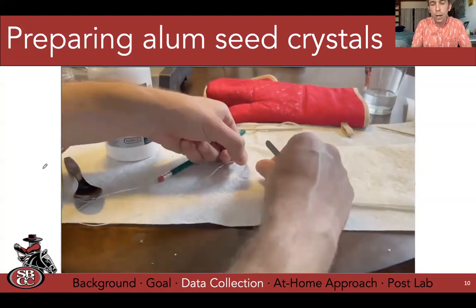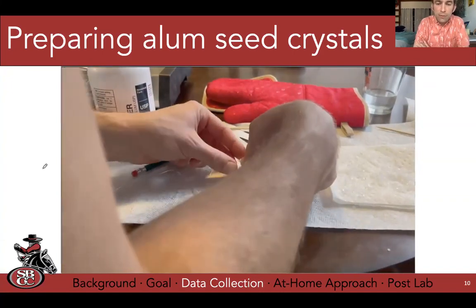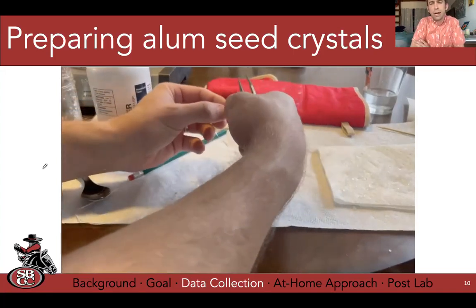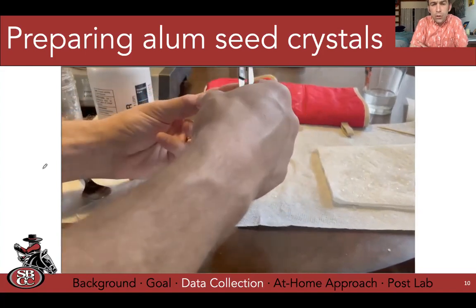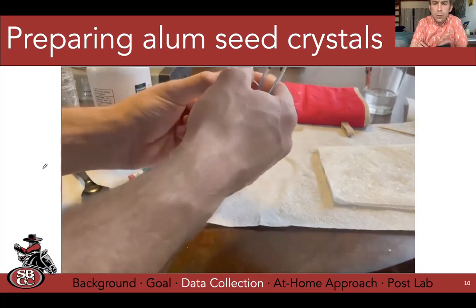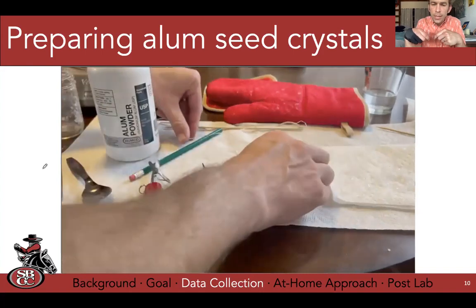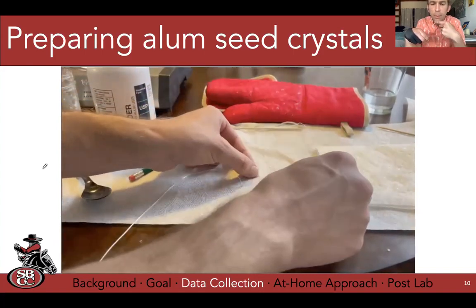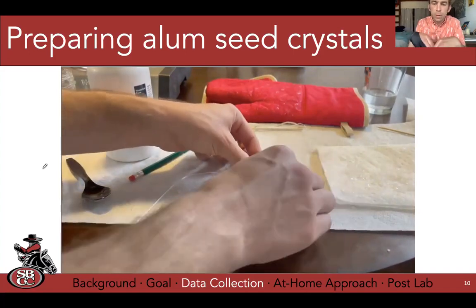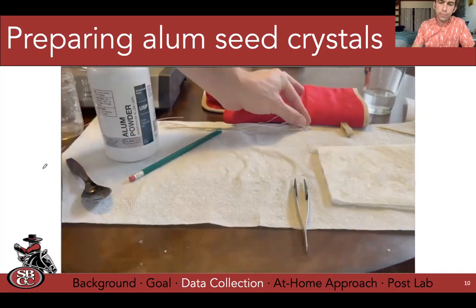But you'll see the second one. So here I've finally slowed down the video, which means I finally got it. You can see I'm using a lot of fingers here, trying to get the floss just around it, just right. So it's a little bit of a tricky operation. But once you get it, the crystals hold pretty tight in the floss because it's a little bit stretchy. And so then you'll see sped up how much faster it is to do. Once you start to get it, I think this one just went like nothing because it's a small learning curve.